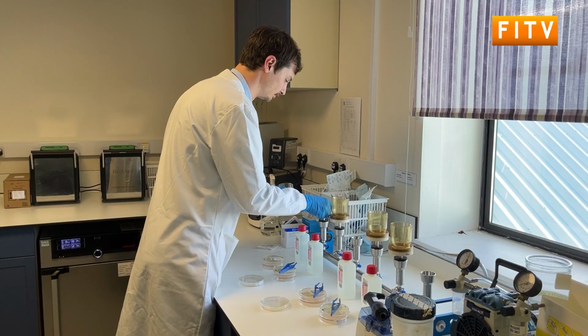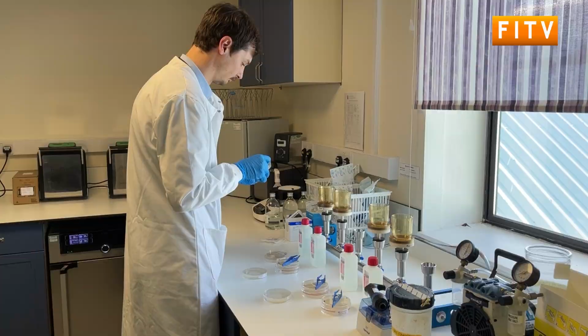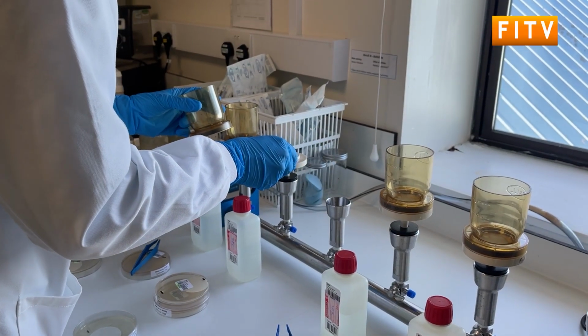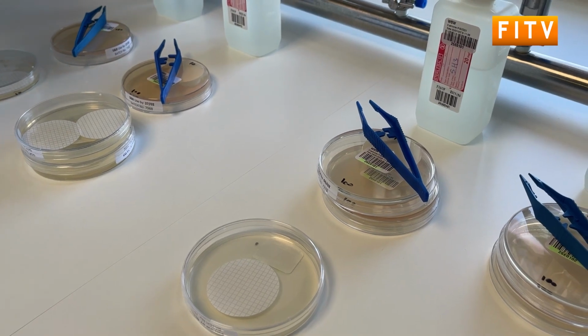It does give us more credibility on the international stage, rather than samples coming from a little unknown remote island that who knows what standards they're working towards. It gives us that credibility that we are, even though small, just as capable as a big lab. And in a world that is moving more and more towards accreditation everywhere, the last thing we want to do is be left behind.